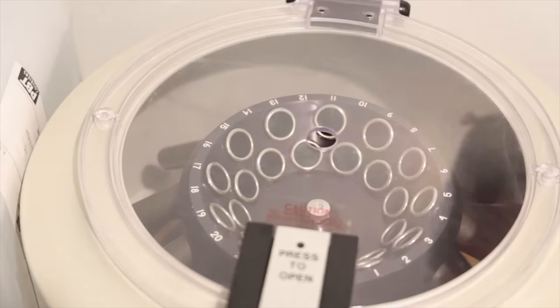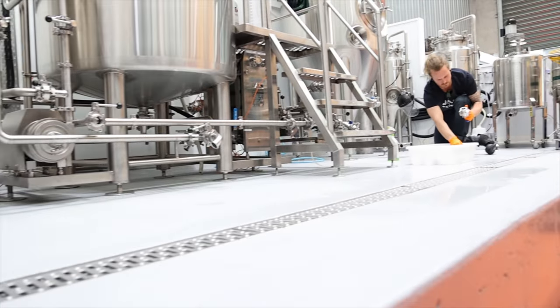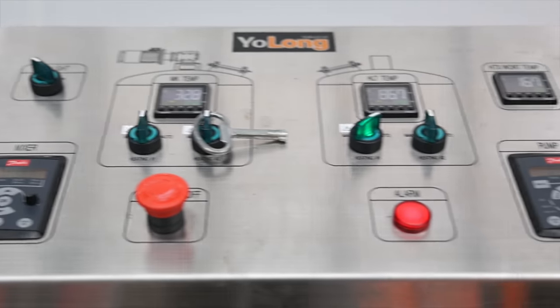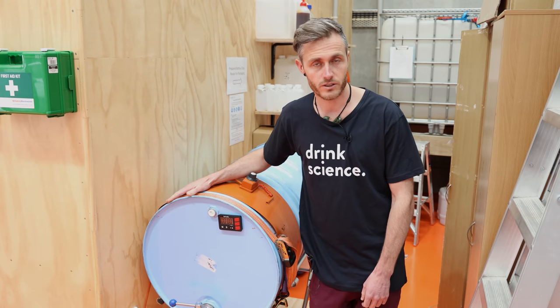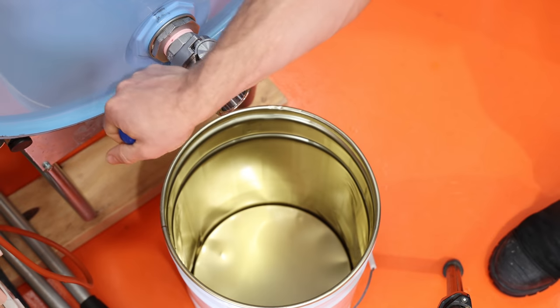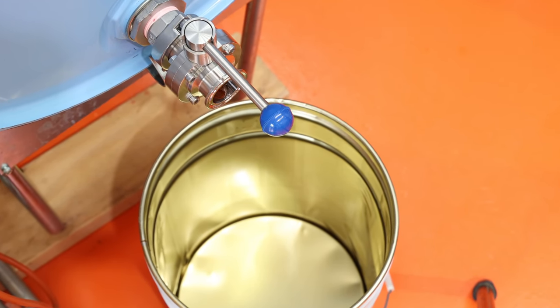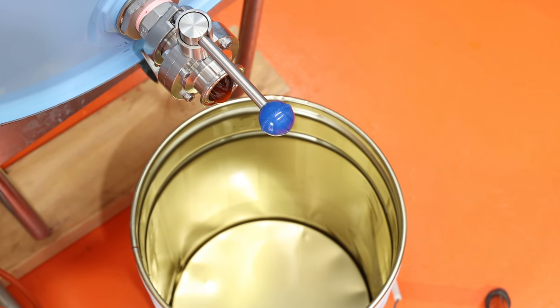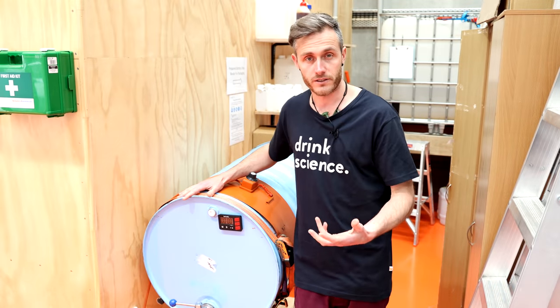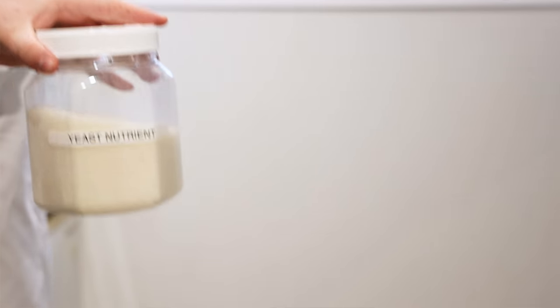There is a bunch of cool equipment around this place to make a home brewer or home distiller froth at the mouth, but what you will not find is a mash tun — they're using something else to make the food for the yeast. This drum right here is liquid malt extract or LME. It's basically a concentrated syrup made in a similar way to how beer is made: you start with your barley grains, you mash them, you boil them, it's then concentrated into a syrup and packed into this drum. This is the main ingredient that our yeast likes to eat, and because we're growing yeast for breweries, we want to feed them a food that they're familiar with. Along with that, we supplement it with nutrients so they're feeling extra boosted to do the job.